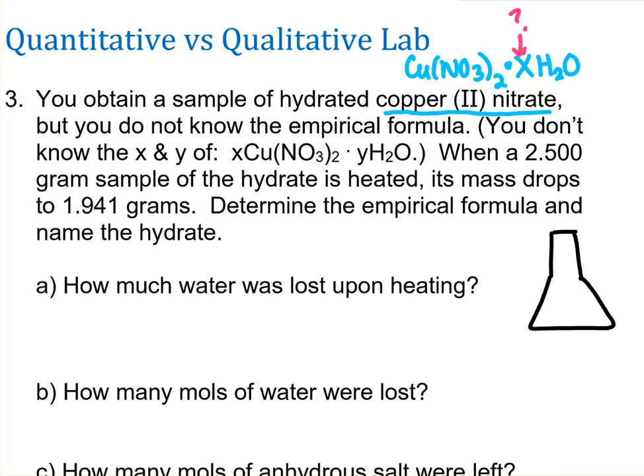So what we did, and I'm going to just kind of draw like ours were, we had bright blue crystals, just to remind you, and we did 2 flasks, not just one, but I'll show you with the one. We put the crystals in our flask, and then we heated it on our hot plate.